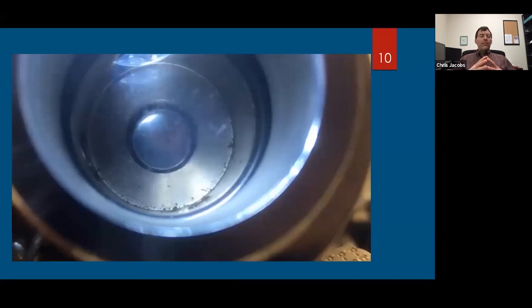Okay, now you could not actually see the condensation on the mirror just because of the way we had it set up in the lab. Very difficult to be able to see that. So I'm going to show you another video where we actually get to see the condensation temperature. Now you're going to be looking right in this area right here. This distance here is about maybe 1 centimeter, maybe 2 centimeters, not very big. And if it covers this entire mirror, the internal mirror, you probably overshot the dew point.